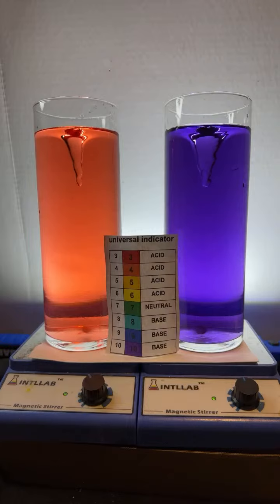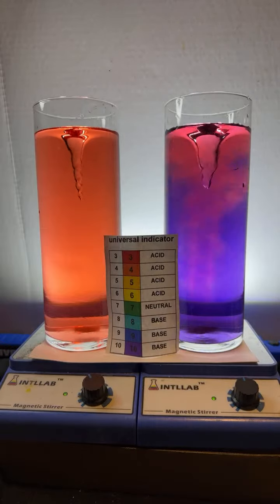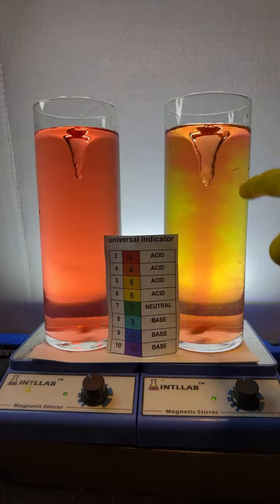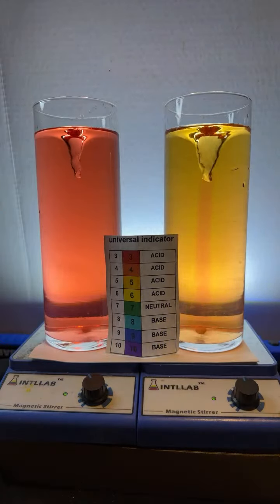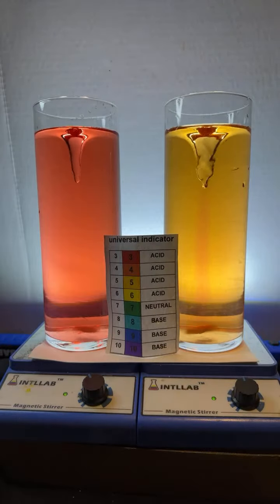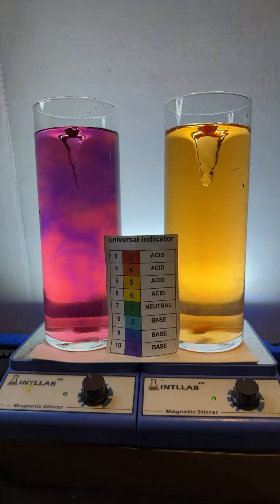KTA, I'm going to try to get it to pH 7 for you. So here's what we got to do. Watch what happens. Elephant's toothpaste, I'm doing that actually this weekend. I'm doing a show for a bunch of kids. We're going to do some elephant toothpaste. So I added a drop of acid to this. It was at pH 10. It looks like I overshot neutral. We're at like pH 6. It's really tough to get to neutral, but I'm going to give it a shot. First, I'm going to make this one over here acidic. And then I'm going to add a drop of base to see if we can get that green color to develop. Give it a go.